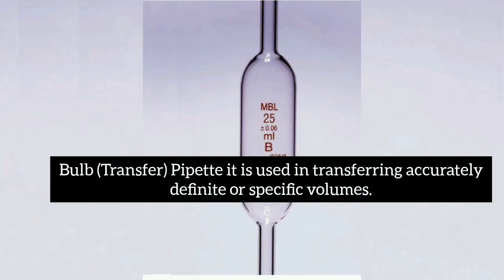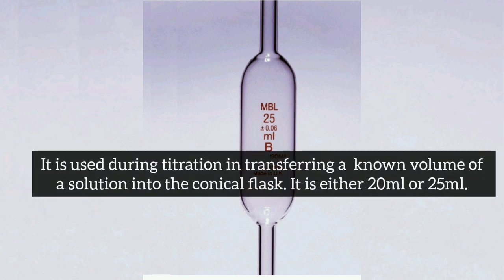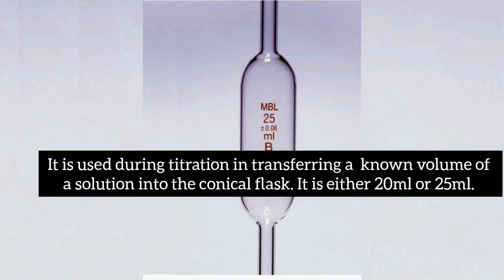The bulb pipettes, which we also call transfer pipette, are used in transferring accurately definite or specific volume. It is used during titration in transferring a known volume of a solution into a conical flask. It is either 20 ml or 25 ml.